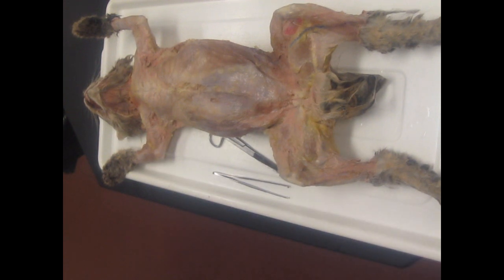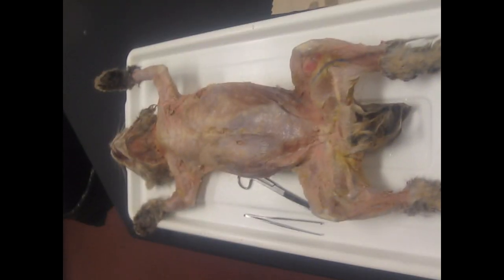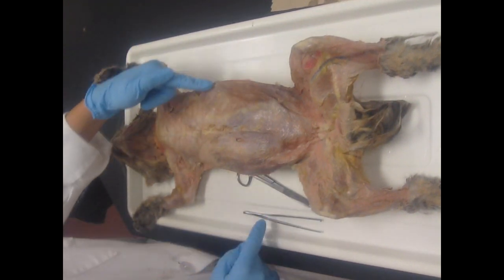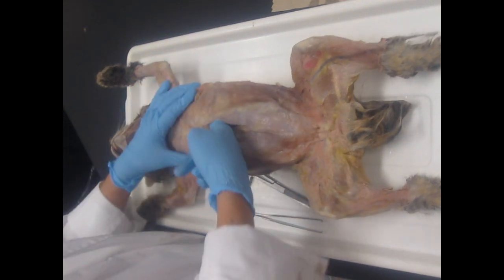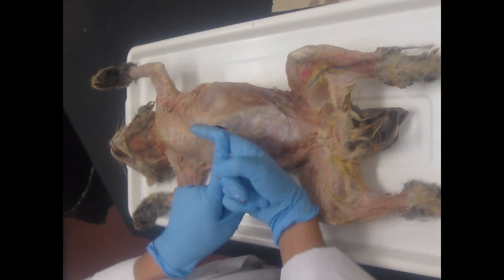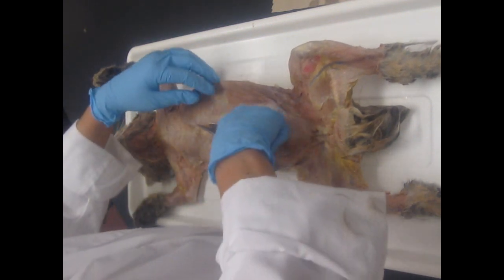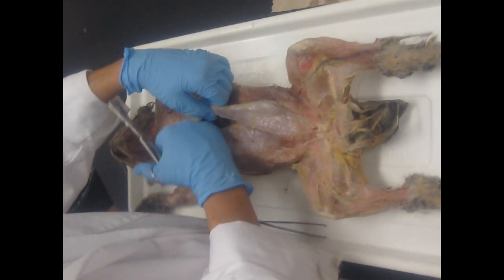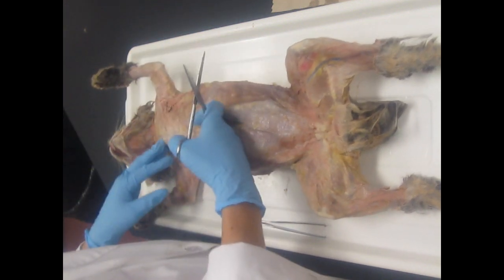Now the diaphragm, remember, is the natural barrier between the two cavities. It's a skeletal muscle that goes up underneath the ribs. So all you have to do is palpate where that diaphragm is. I still have about that much farther to go. You don't want to cut off the diaphragm. That needs to remain intact for your points. You just want to cut up to it. This is fat. Okay, so I'm at the diaphragm.